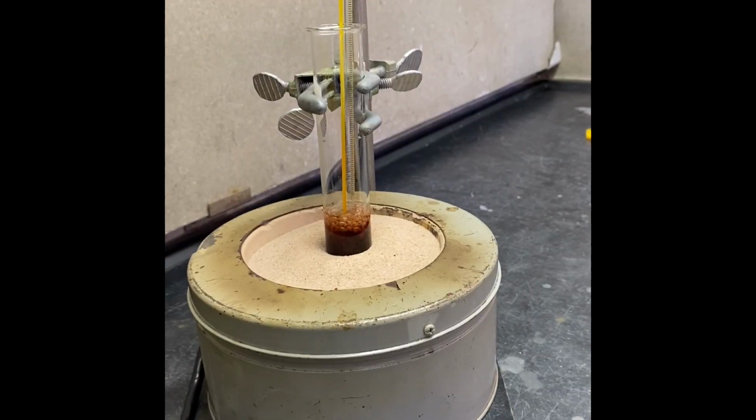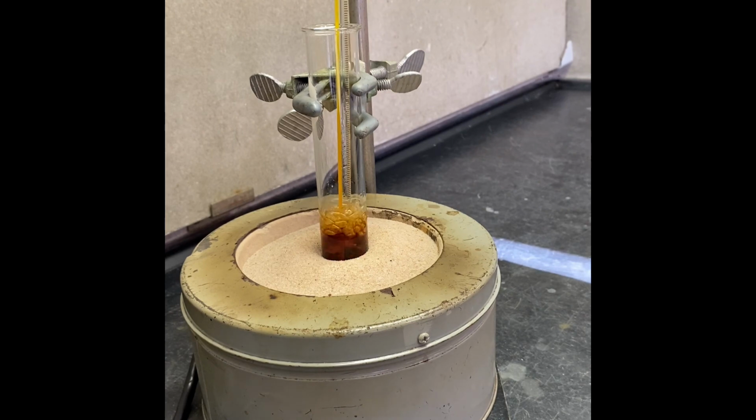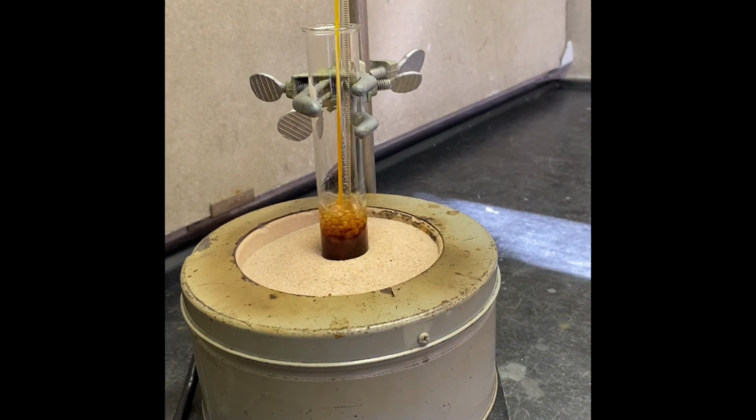So when we're done with the reaction, we're gonna lift that up and that color change maybe gonna see better. Just gonna look at the color change. If there's no change anymore, we're gonna keep boil at that temperature another 5 minutes, and then we're gonna take off from the sand bath, let it cool down to 100 degrees Celsius, and then we're gonna pour 15 milliliter of ethanol to our reaction flask. Looks like color is not changing, so we're gonna boil that another 5 minutes.